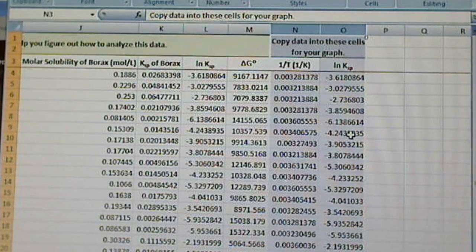And what you're going to want to do for your post lab is report your values for delta H and delta S, as well as for delta G, all of those being standard temperatures. And you're going to want to show your publication quality graph, using what you've learned this quarter to produce a good graph, and include that with your post lab, with your data manipulation and your values.